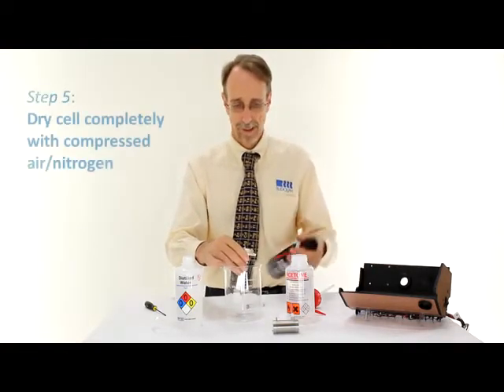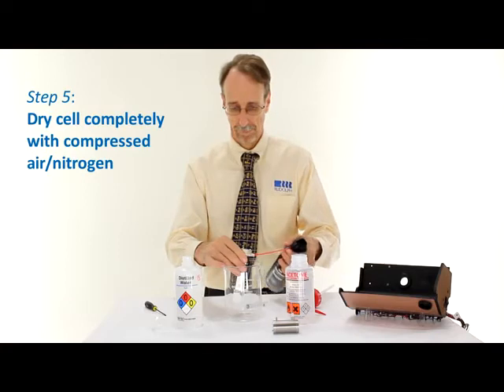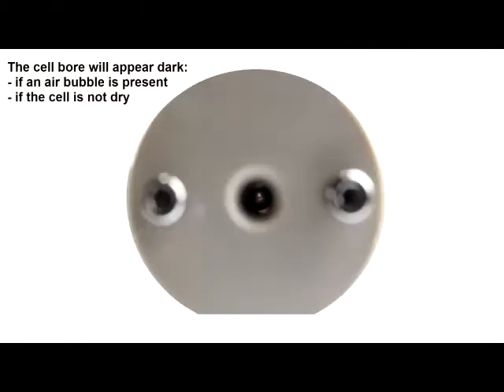And finally, dry the cell completely using the air. As a final step, I'll check that the cell is dry, just by holding it up to the light and looking down, ensuring there are no bubbles or anything left on the inner walls of the cell.